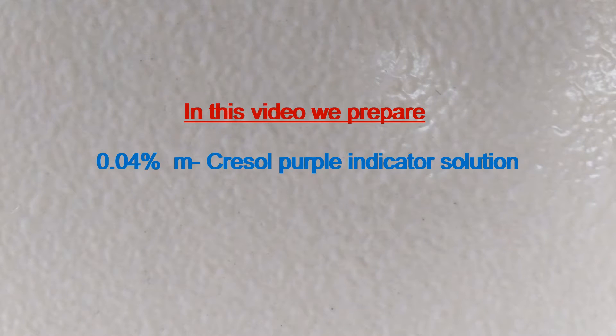In this video, we prepare 0.04% metacresol purple indicator solution.